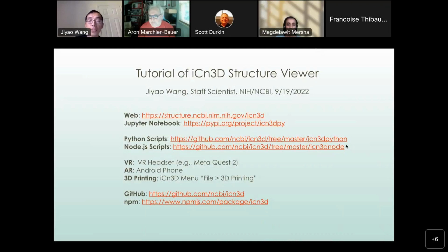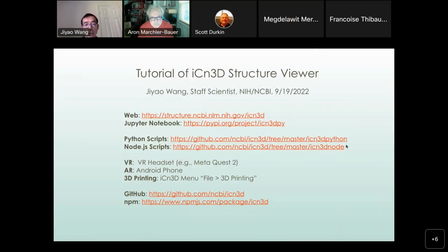Hello, everyone. So this is going to be a demo about iCn3D. The first part I'm going to present, and then you can ask me questions in the second session. So iCn3D is a web-based 3D viewer to replace the previous CN3D at NCBI.